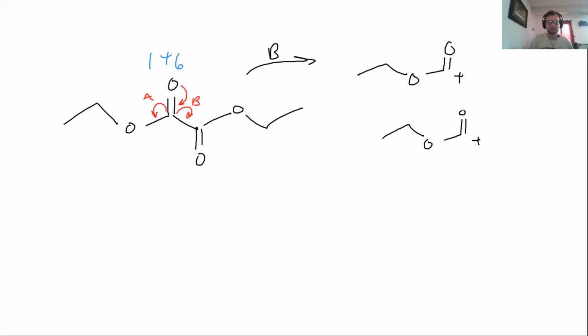So based on that, I know we have two of them. That's kind of why we see peaks that are twice as much, because there's two of these guys. And we'll go ahead and put the weight right here. So we got 15, 14, 16, 12, 16. Go ahead and throw that in a calculator. 15, 14. And so this is how we get the 73 peak.